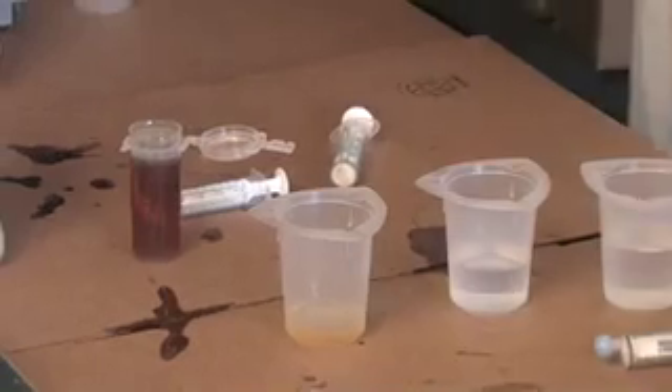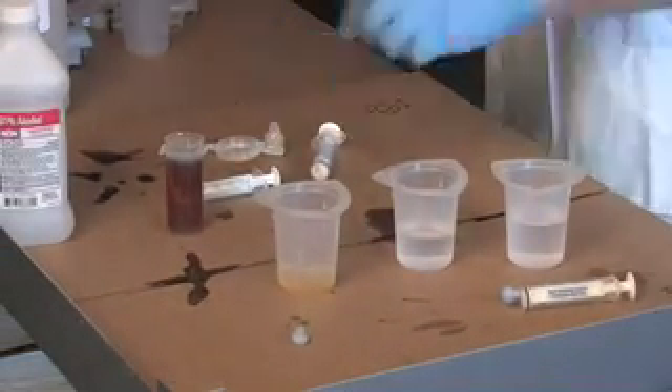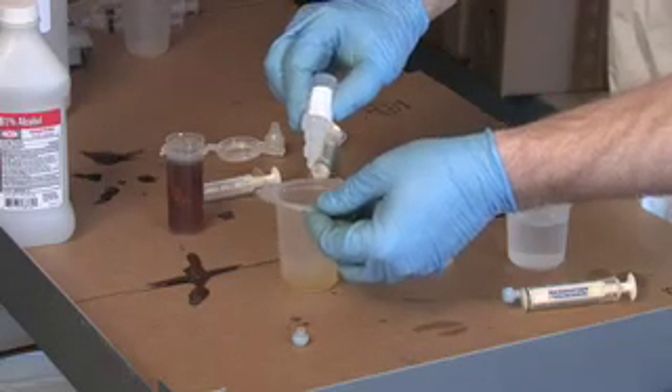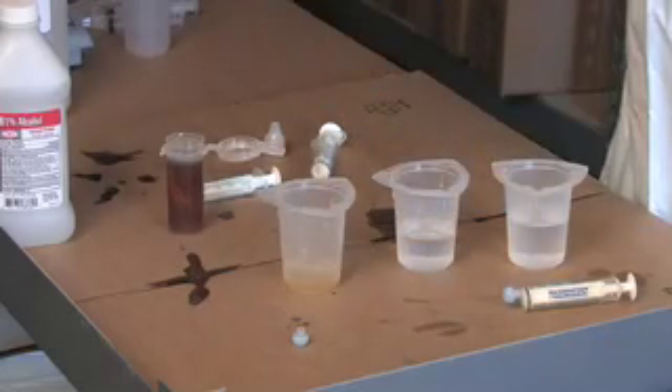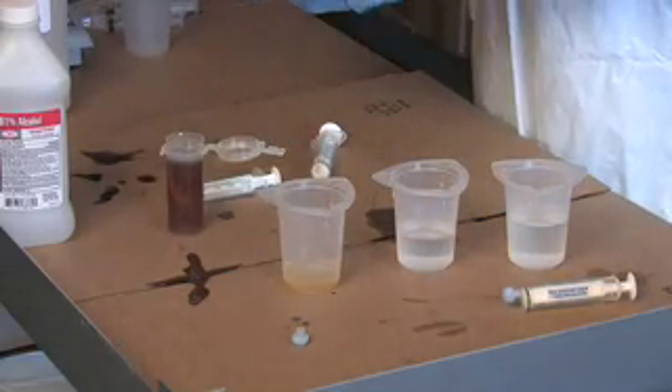To this mixture, we're now going to add about three or four drops of our phenolphthalein. This is just a pH indicator — it does nothing more than that. It's not critically important how many drops you put in because all this is doing is indicating pH.